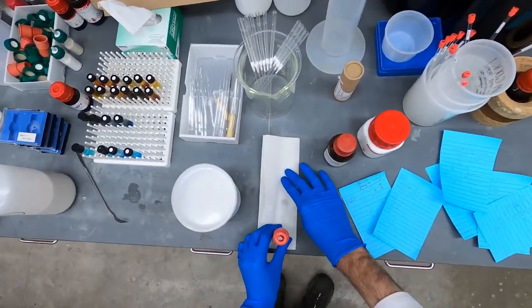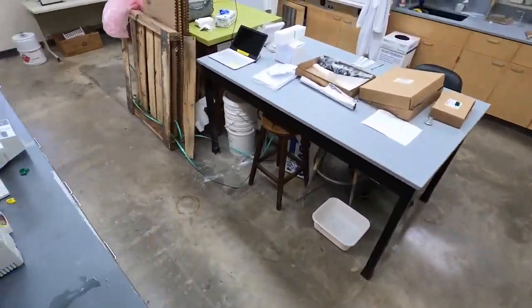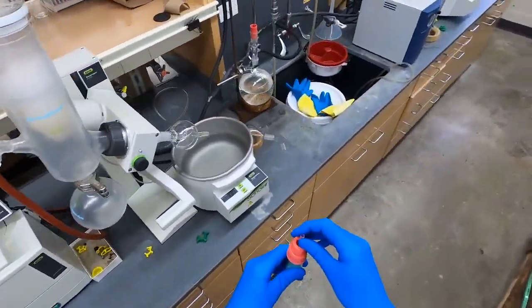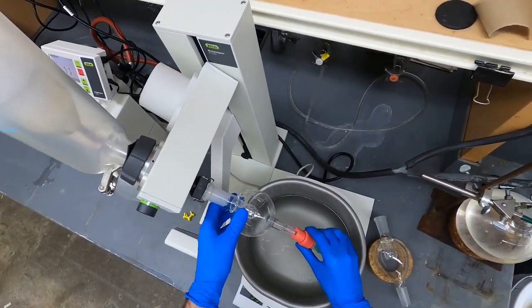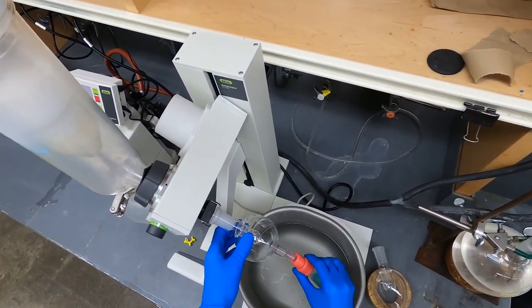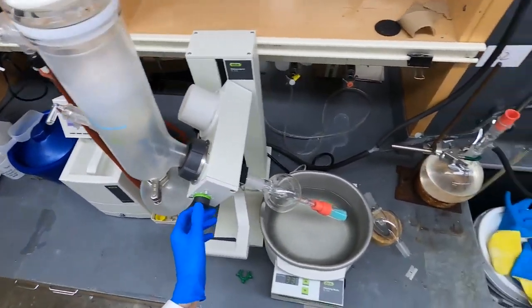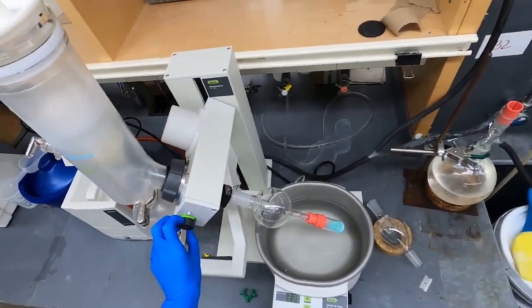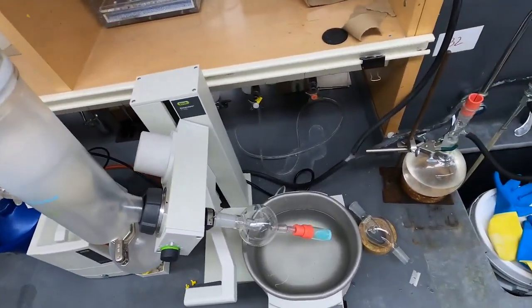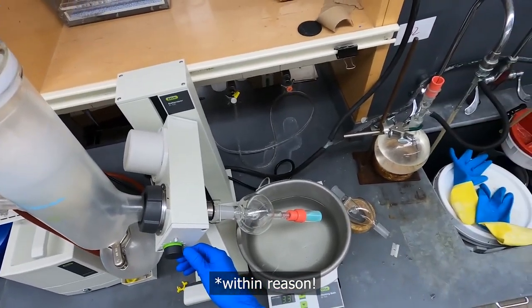And the reason I'm using Celite for this dry load instead of silica gel, which you can use either, or you can even use mixtures, is because Celite does not have any polarity associated with it. I think it's not small enough for there to be any meaningful interactions with your analyte molecules. And so it doesn't have any resolving power. And so you can use as much as you want, and it's not going to hang on to your compounds like silica does.